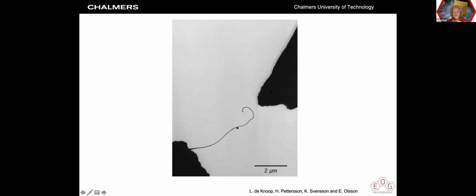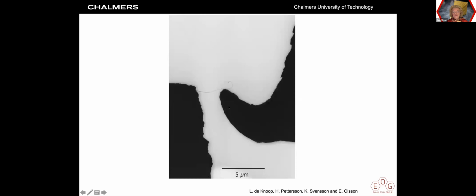this gold wire? Well, what we do is that we take this gold wire here, using the millimeter ability to move it, and take it over here on this sample and then simply bend it. And then we are able to reach also on the side with the very same shape of the manipulator. So it is a very nice feature where we can actually use a joystick where we move around our STM tip here in the microscope to access the sample and also do the manipulation.